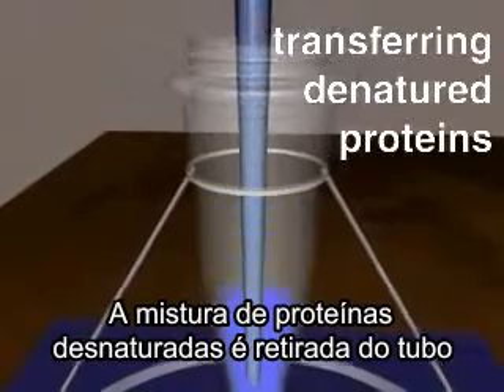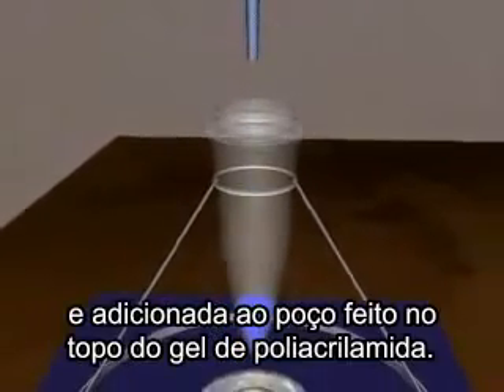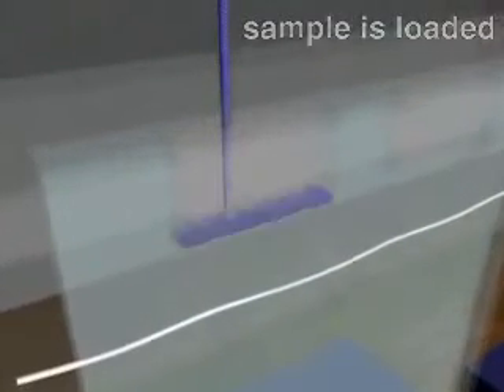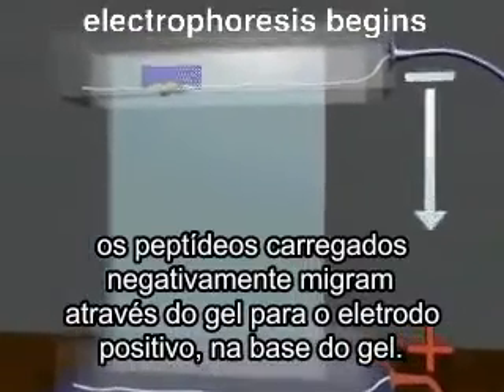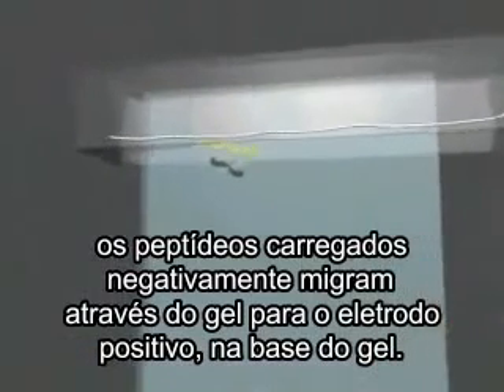The mixture of denatured proteins is then transferred from the tube and loaded into a well that has been cast in the top of a polyacrylamide gel. In an electric field generated by a power supply, the negatively charged polypeptides migrate through the gel toward the positive electrode at the bottom of the gel.